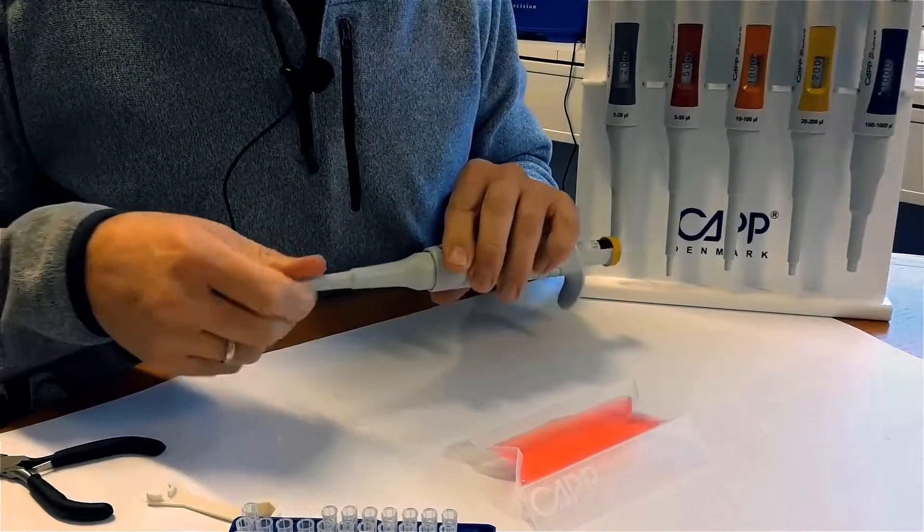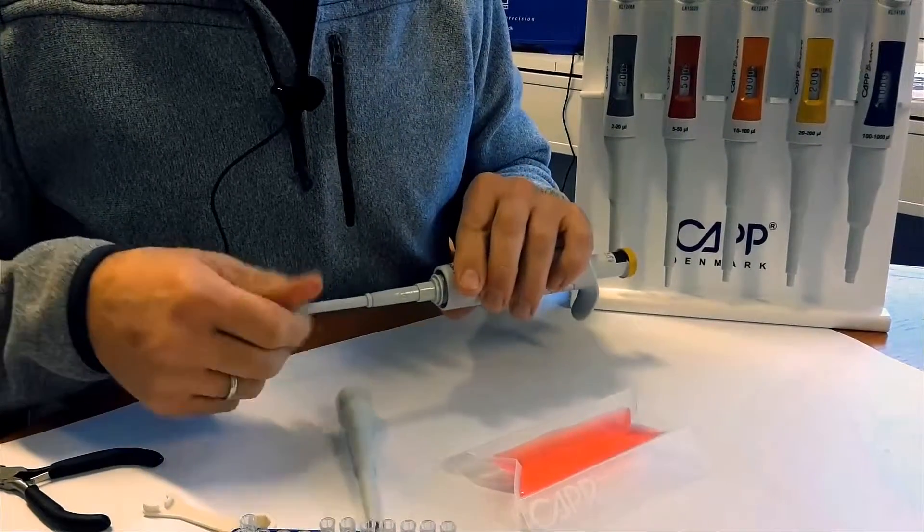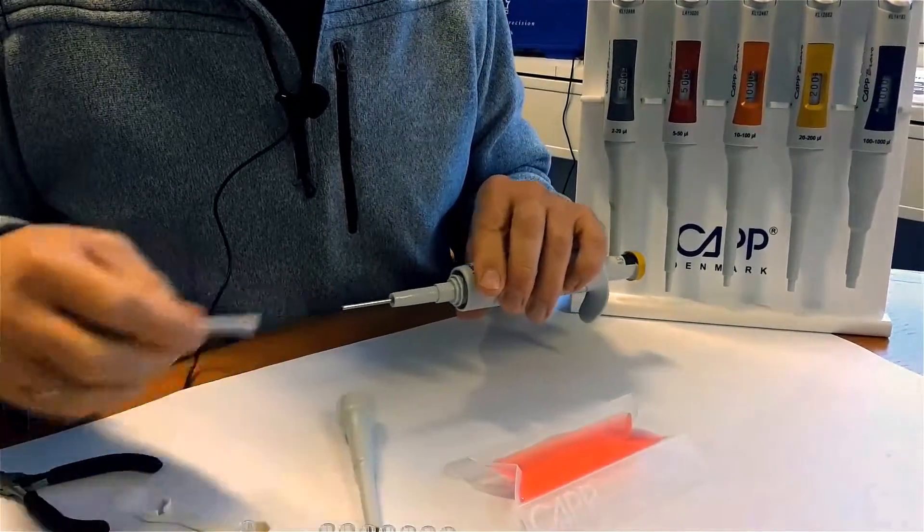Unscrew the tip cone lower part and you will access the piston. Perform a visual check ensuring that there is no sign of contamination or damage.